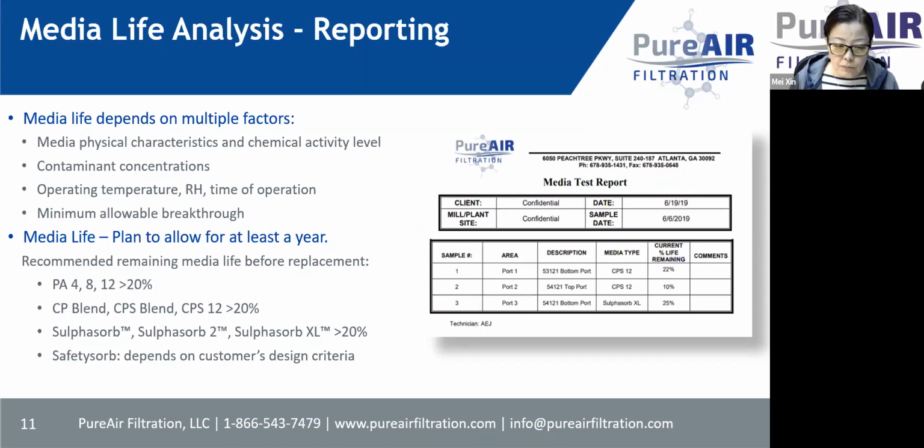And for the safety zone, that's going to depend on customer design criteria. Some people probably feel comfortable over 50%. Some of the big water facilities, maybe they would like to have over 70% media life remaining, and they need to have us change out because it's for an emergency gas scrubber. So this is a very high-level media life analysis.